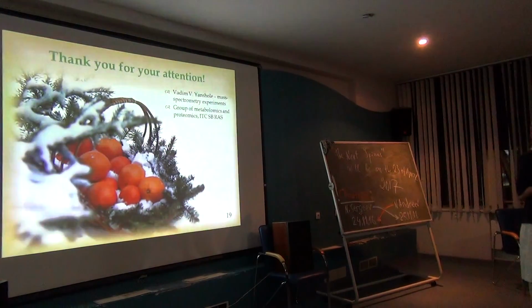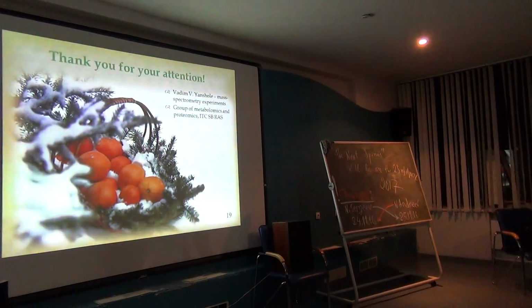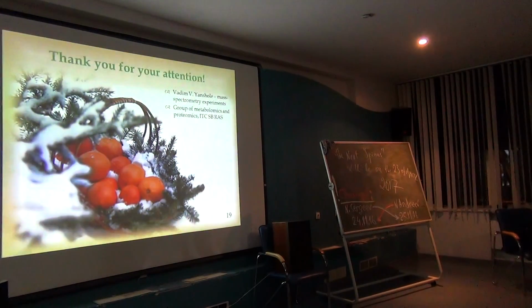Okay. What's the control group? Just water. The first group was given water. This group was given just water because it was necessary to have similar stress conditions. So we just intragastrically gave the water.